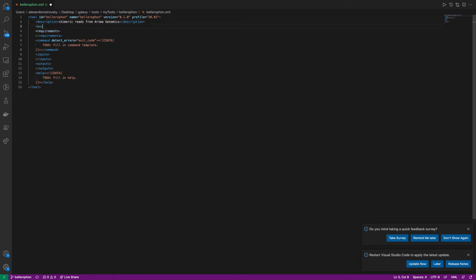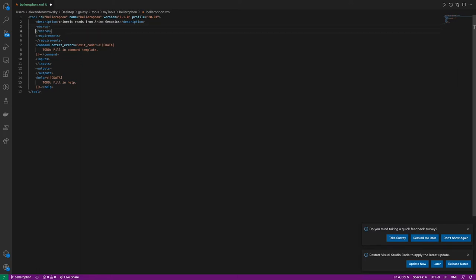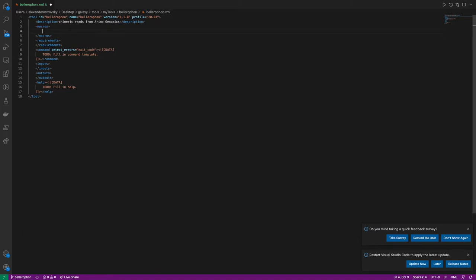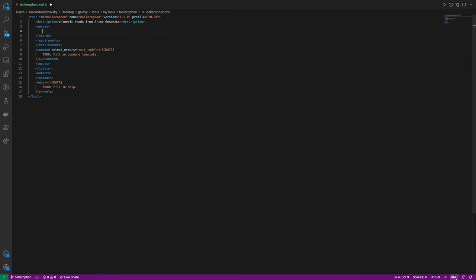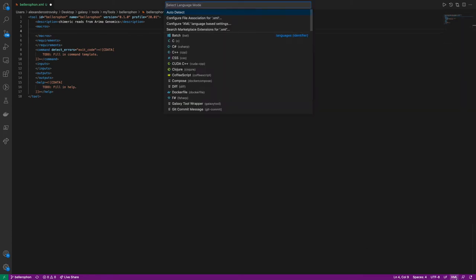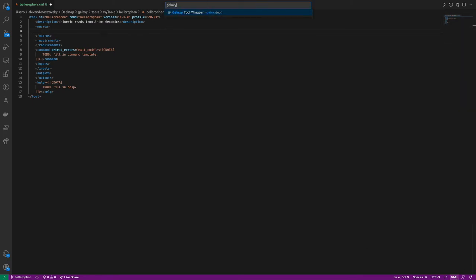Next, we're going to add the macros tag. The macros tag has two possible functions. One is to add XML tags that are repeatable throughout the wrapper, which we will not be getting into in this video. However, it is described in the training.